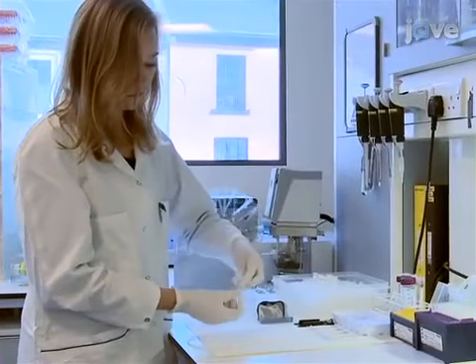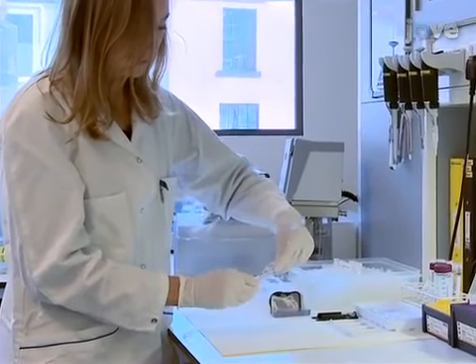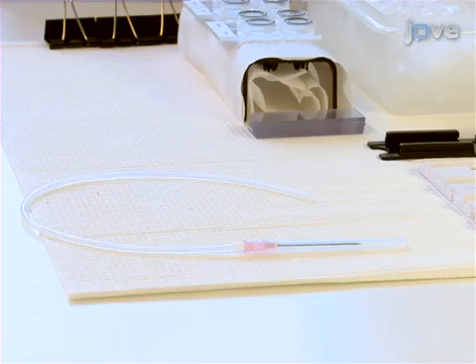Before beginning the experiment, couple an 18-gauge hypodermic needle to a 2 mm inner diameter piece of heparin surface-coated silicon tubing. The plastic surfaces are coated with heparin in order to prevent unspecific activation of coagulation.